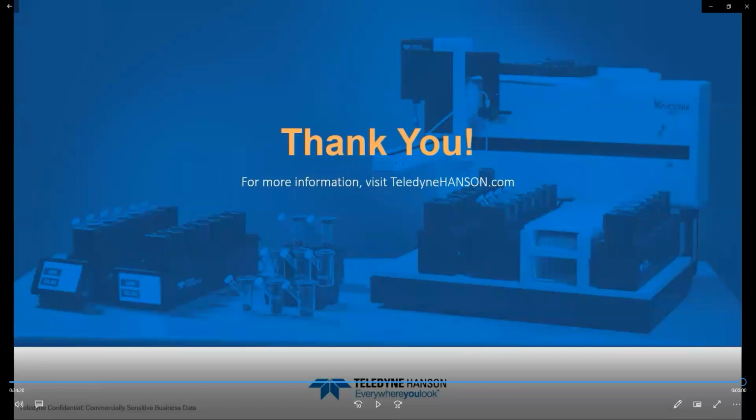There are a few questions about how you pre-treat your samples before HPLC analysis. I know Hannah mentioned in the presentation you're using LC-MS, not HPLC. Do you have any experience with HPLC, Hannah? Yeah, in fact, LC-MS is a kind of HPLC, but it depends on the detection mode. HPLC can be used depending on your molecule and on the sensitivity of your method.